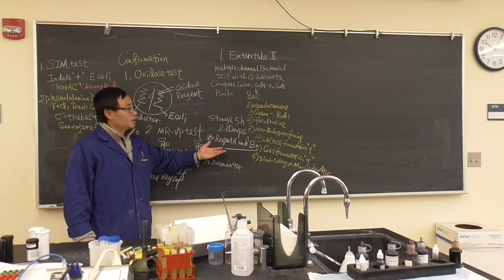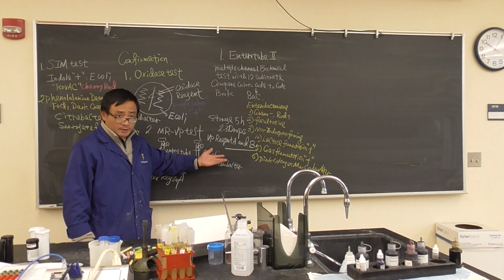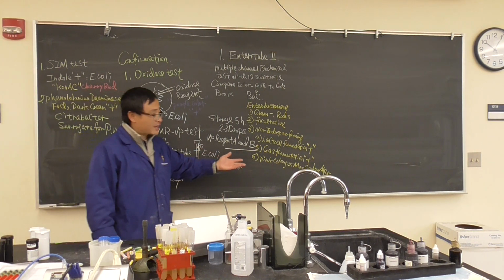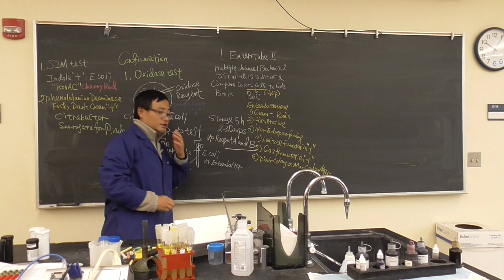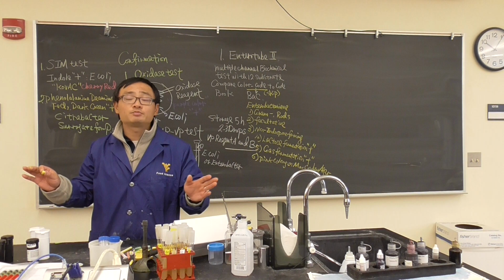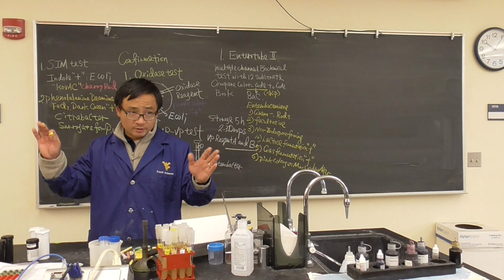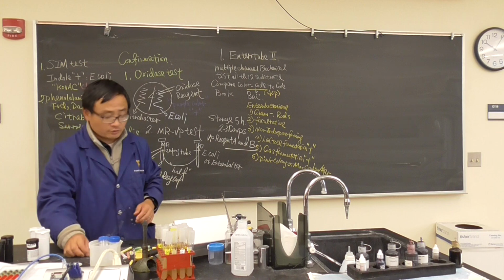So, you cannot use the traditional methods to do the identification. It is hard. Therefore, we use EnteroTube 2 compared to the code book. It will be easy to identify it, and it is one of the rapid testing methods. However, we will skip this code comparison. Okay, it's too complicated. Especially if you did not do a good job of the aseptic technique, it brings all the bacteria there. Then there's no way to compare. It's confusing. So I'm skipping that, but you get a practice of how you use EnteroTube. You will have fun. Okay.